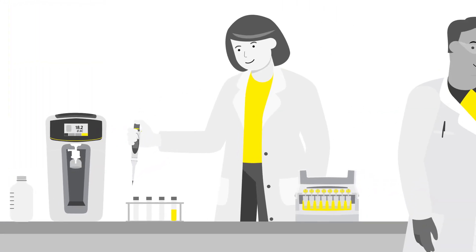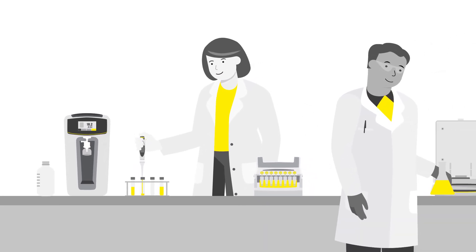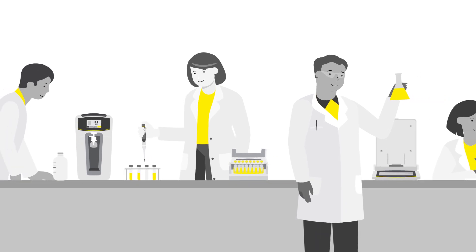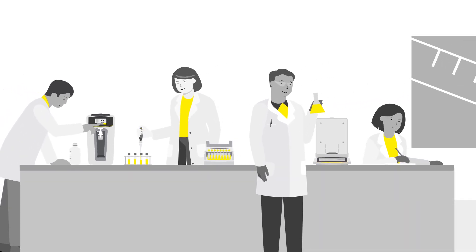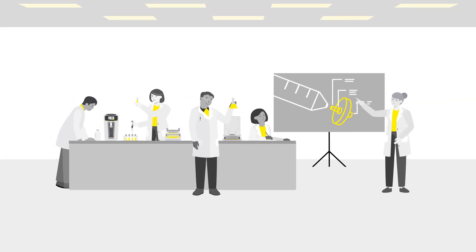At Sartorius, we understand that both your sample and time are precious. So our scientists have been hard at work developing a suite of tools designed to make your HPLC sample and standard prep a breeze, increasing the reliability and accuracy.